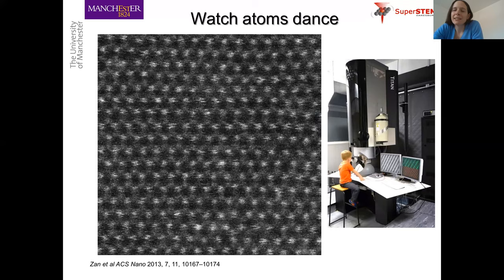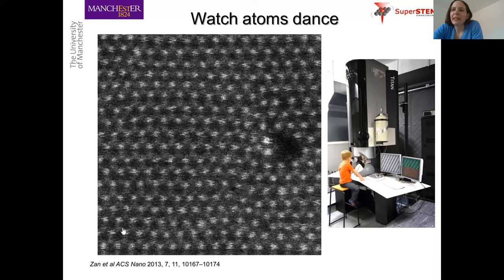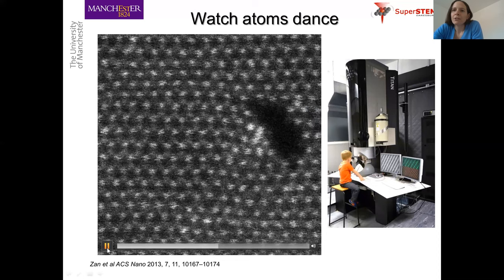And after a certain amount of time or a certain amount of electron dose, we start to see a hole opening up in this single layer material. So I can show you that here. We can see that we've lost both molybdenum and sulfur atoms from this region, and the sulfur atoms migrate away and they leave this buildup of molybdenum, and that's what this bright region here is now. This is more of a metallic region, it's a pure molybdenum area.